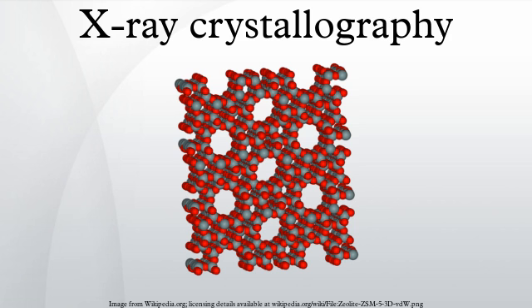Crystallization. Although crystallography can be used to characterize the disorder in an impure or irregular crystal, crystallography generally requires a pure crystal of high regularity to solve the structure of a complicated arrangement of atoms. Pure, regular crystals can sometimes be obtained from natural or synthetic materials, such as samples of metals, minerals or other macroscopic materials. The regularity of such crystals can sometimes be improved with macromolecular crystal annealing and other methods. However, in many cases, obtaining a diffraction quality crystal is the chief barrier to solving its atomic resolution structure.